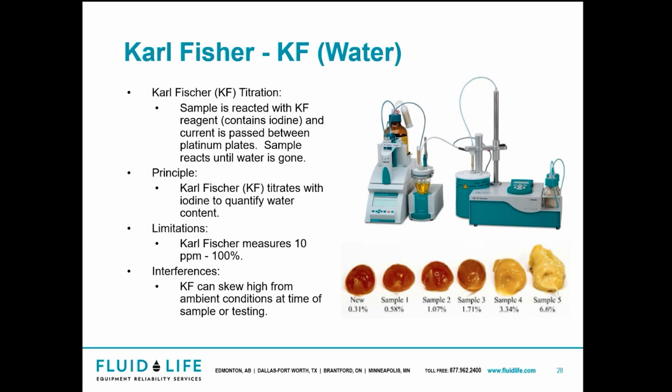Let's go back to oil testing as well. If you test oil, the standard way of doing it is the hot plate method, where literally you take some oil and you slap it on a hot plate, and then you look for it to crack and pop and snap. Now, the limitation to that is that it only starts to appear at about 200 parts per million, whereas something like the Karl Fischer could test down to like 10 parts per million, which is a massive difference.